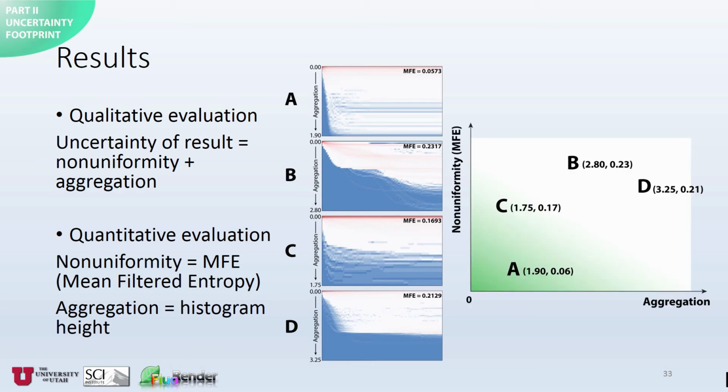When we plot the values of the examples, we can see that example A is the most certain result, which we should accept. B and D are very uncertain. We can try a different initial condition, so that B may become A. If it still doesn't work, such as D, we can confirm that it is one cell. C is ambiguous and may need further examinations.